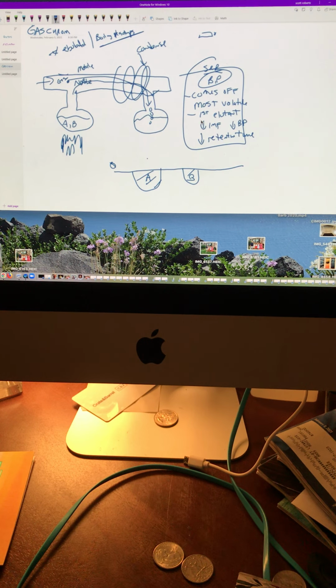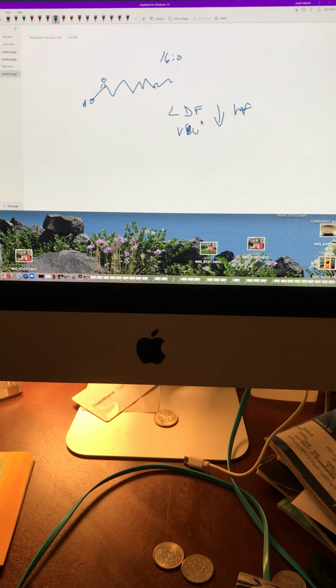Get back in distillation. All right, now let's talk about condensers. What's the purpose of a condenser? To cool it down, because it's a gas. We vaporized it, and now we have to cool it down.